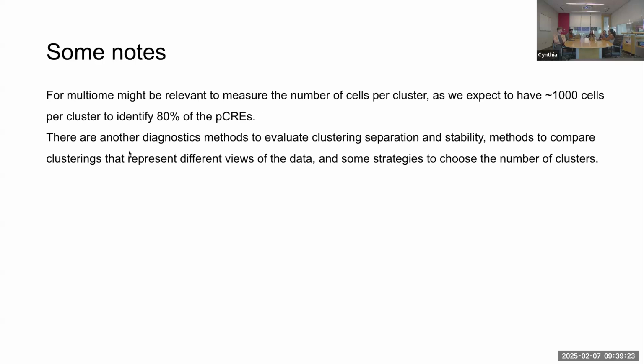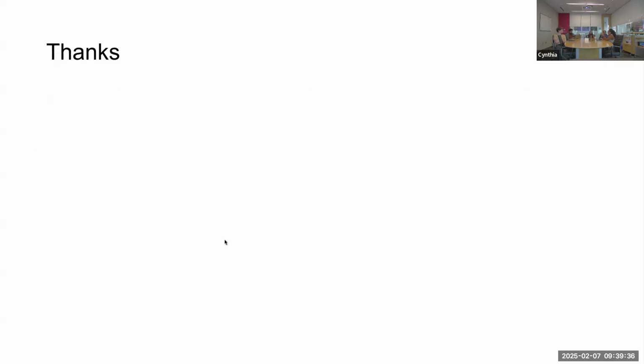Of course, there are other diagnostic methods to evaluate the clustering, separation, and stability, or methods to compare the clusterings that represent different views of the data. But these are some of the statistics that I find useful and I want to share with you.